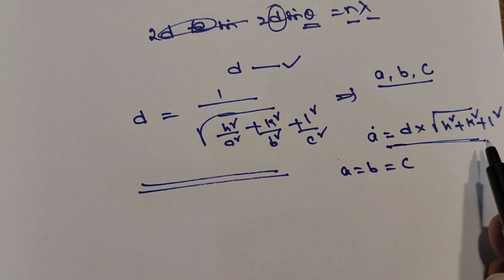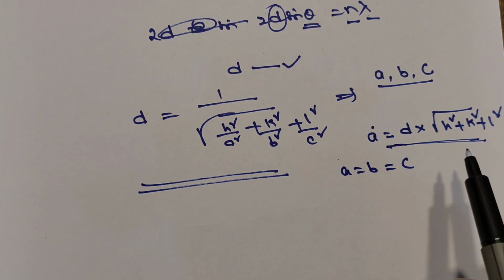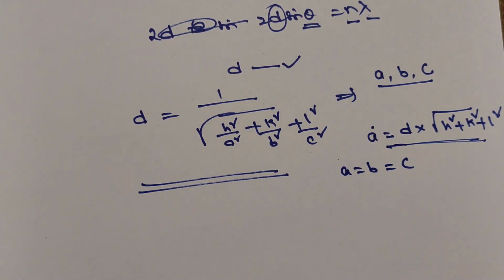So this is about the importance of the X-ray diffraction pattern in characterizing materials. This is a short revision, especially from the exam point of view. If you want to go in depth, there are different structural properties that can be measured by using the X-ray diffraction technique. Thank you.